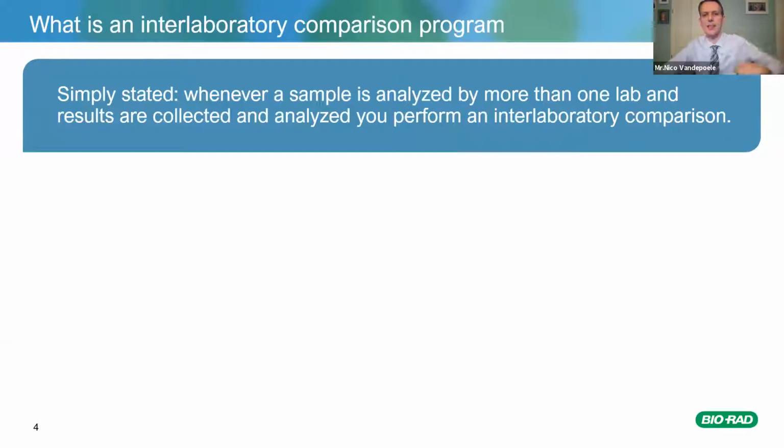It's really simple to start talking about it. What is an interlab program? As soon as you compare samples by more than one lab, and you collect the results and you compare them, you're doing an interlab comparison.